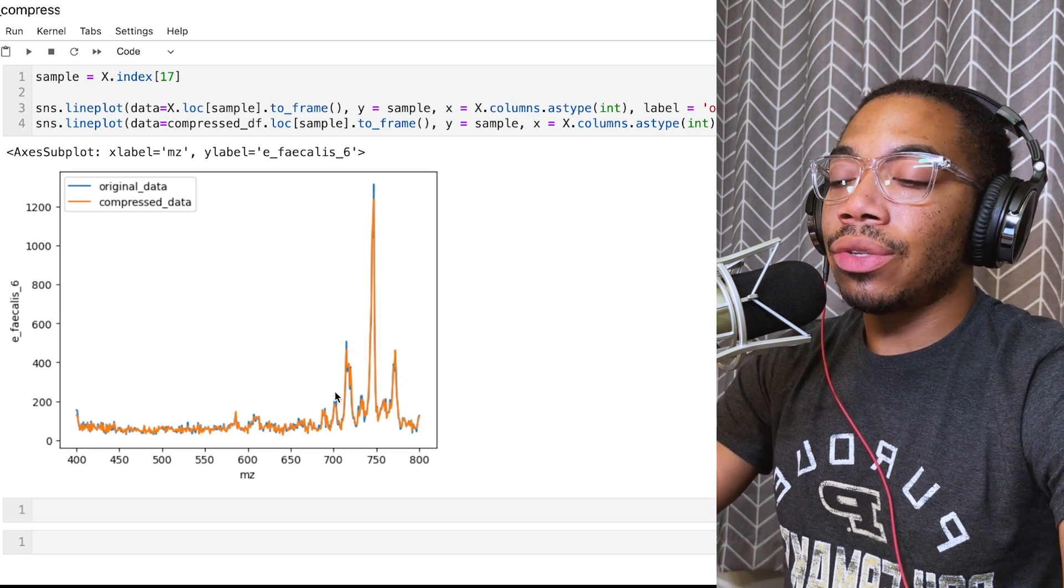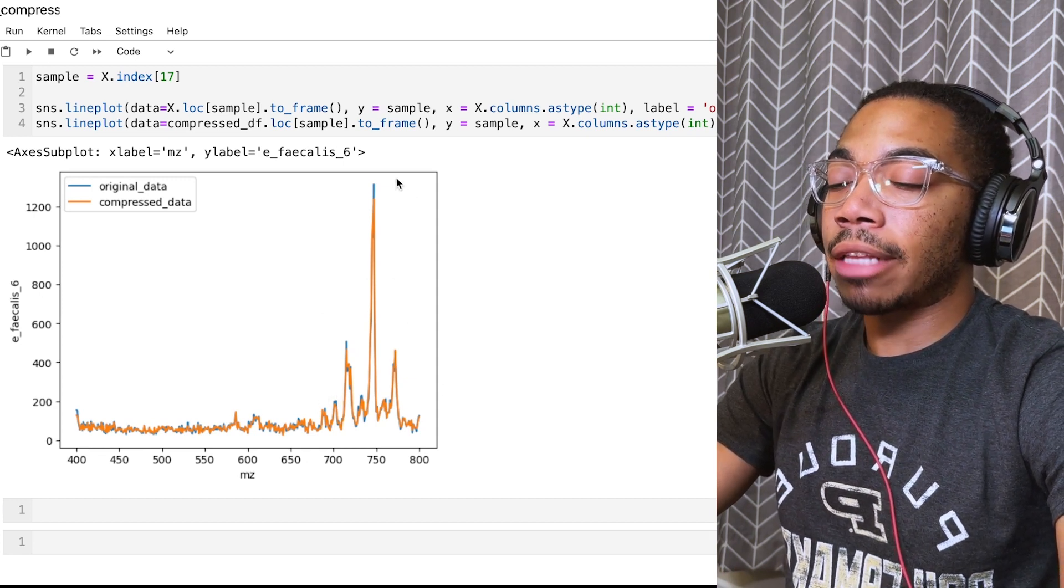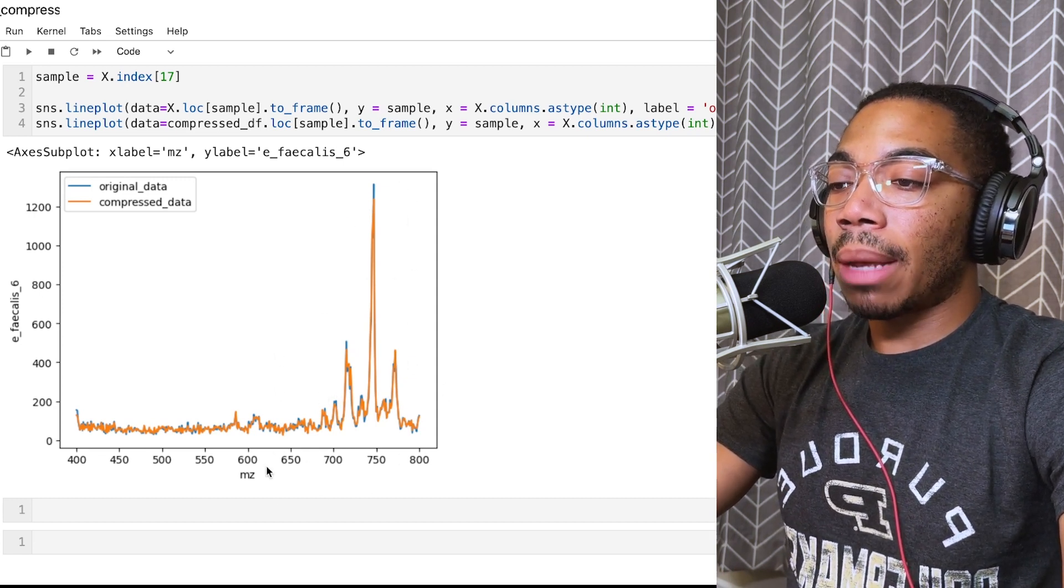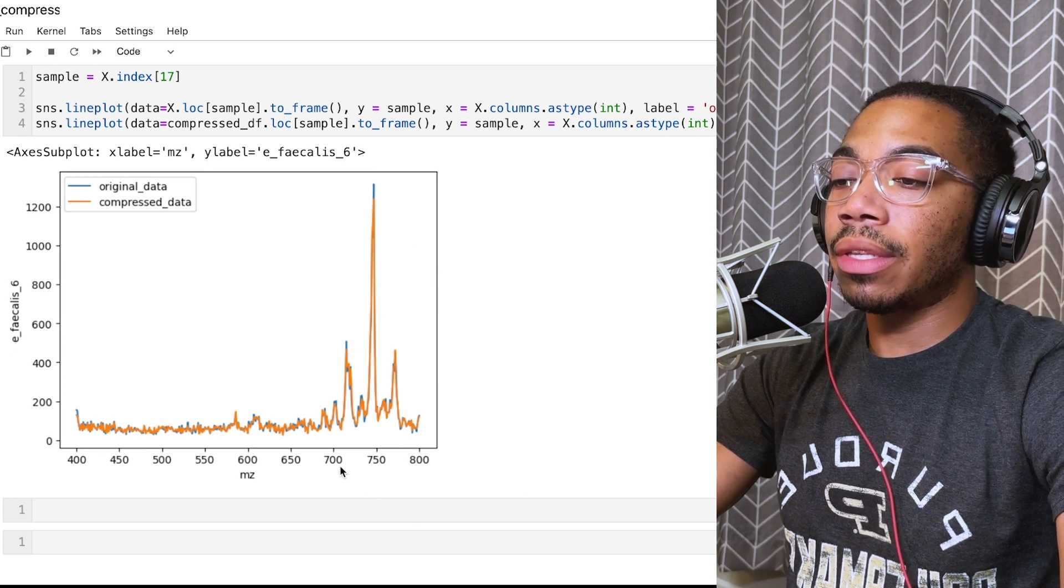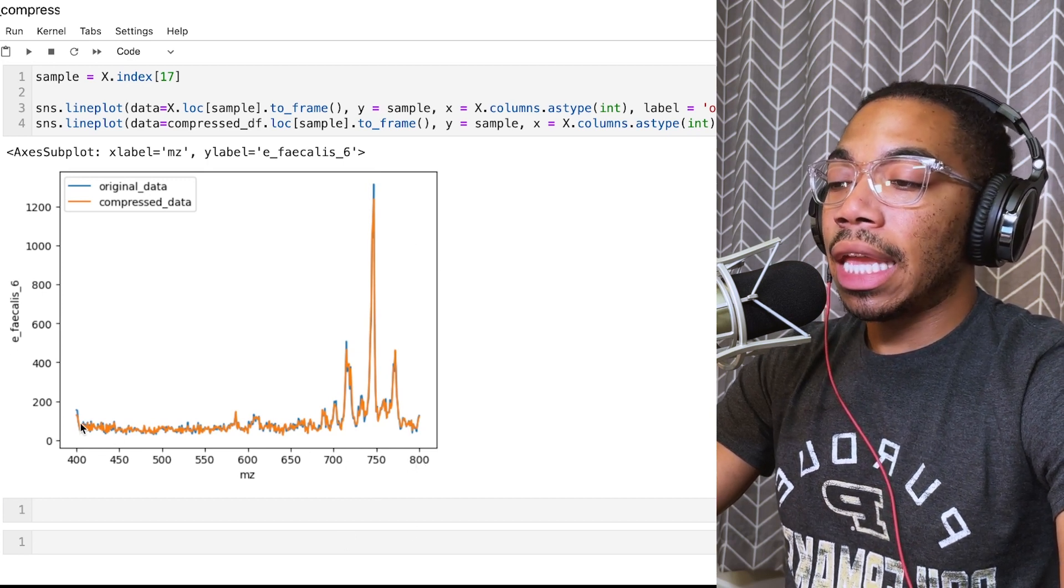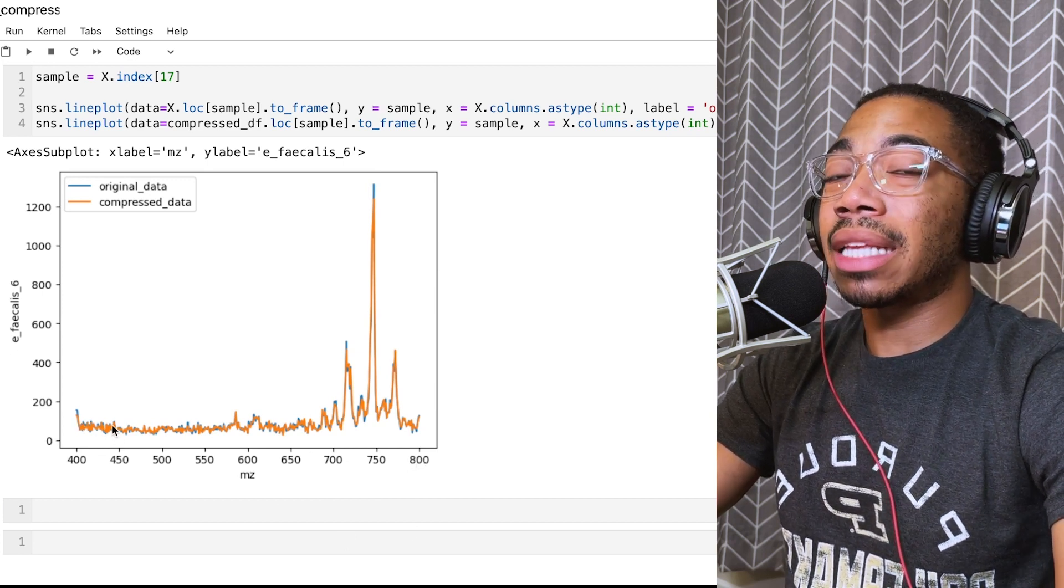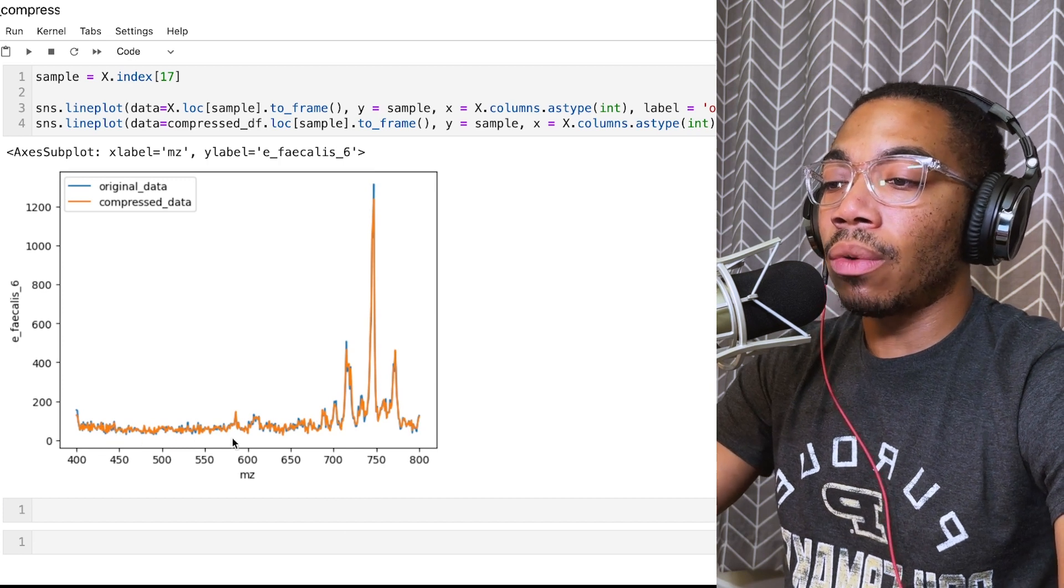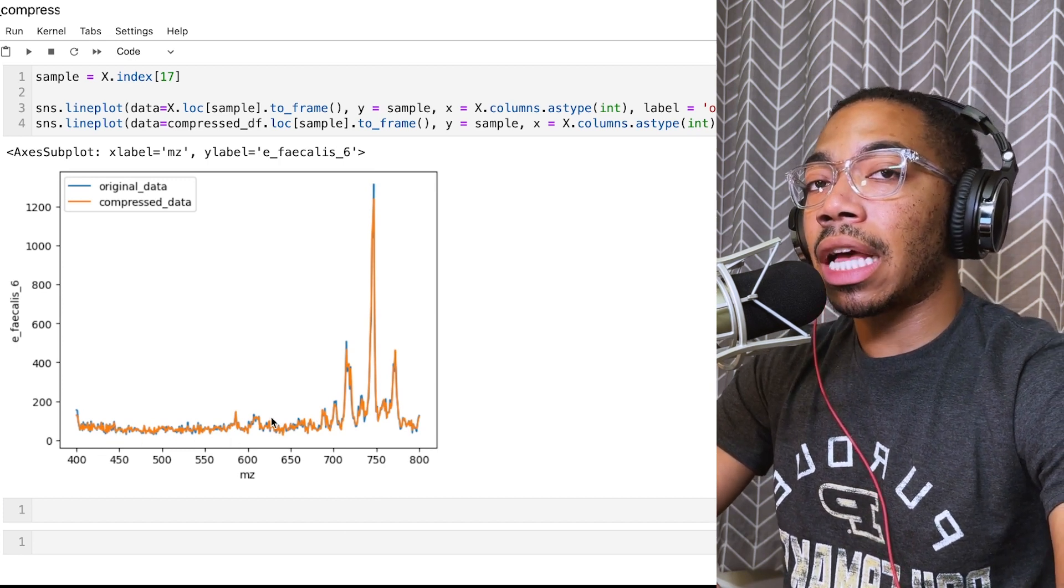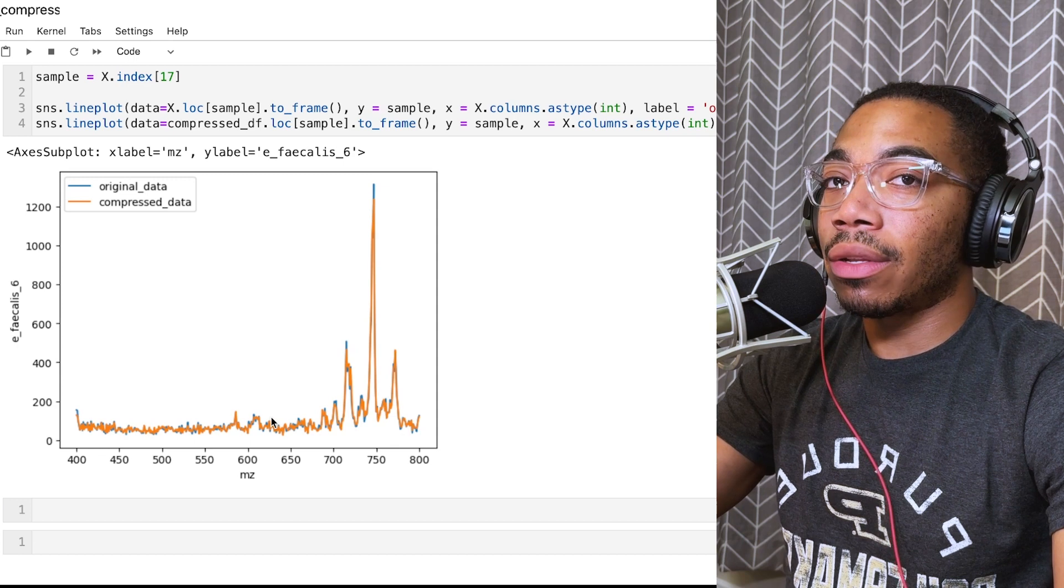In this case, you saw that even with a maximum amount of compression, we're capturing a lot of the major features around the 700 to 800 range and giving up a lot of this high frequency noise in the lower M over Z ranges. This is a common observation for a lot of analytical data.